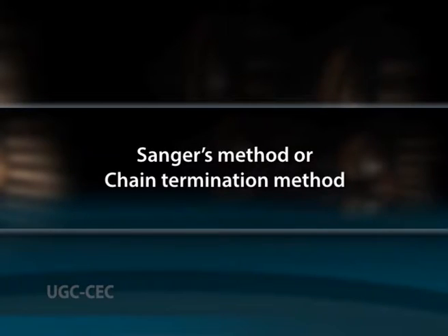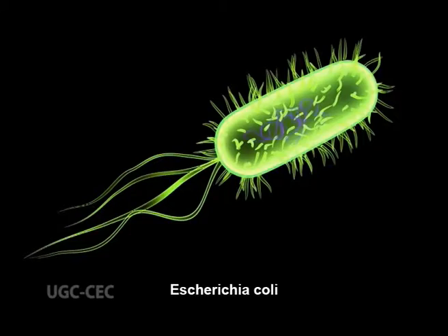Sanger's method, or chain termination method. The first method described by Sanger and Coulson for DNA sequencing was called plus and minus. This method used Escherichia coli DNA polymerase 1 and bacteriophage T4 DNA polymerase with different limiting nucleoside triphosphates.